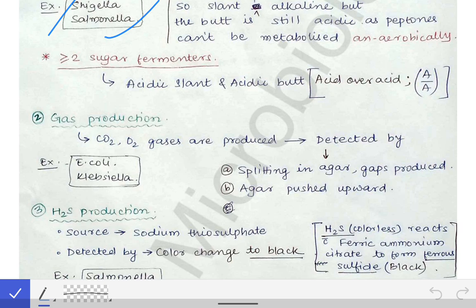So that will be produced anaerobically in both the slant as well as in the butt. That means the acidic change will occur in both, so there will be acidic slant and acidic butt. That means both the slant and the butt will become yellow in color. So it will be called acid over acid reaction, or A by A.